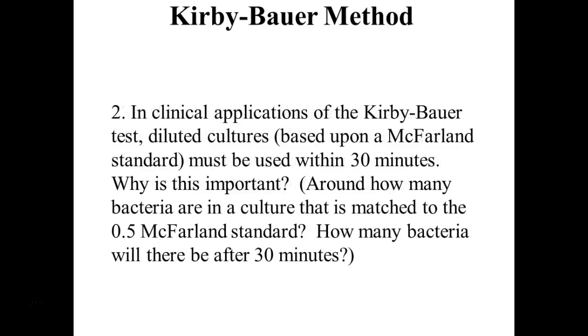So we use the spectrophotometer to try and start with a standard amount of bacteria. And we used it right away. We didn't wait 30 minutes. I did those preparations right away. Why did I make them right away? What could happen to that bacteria in a matter of 30 minutes?